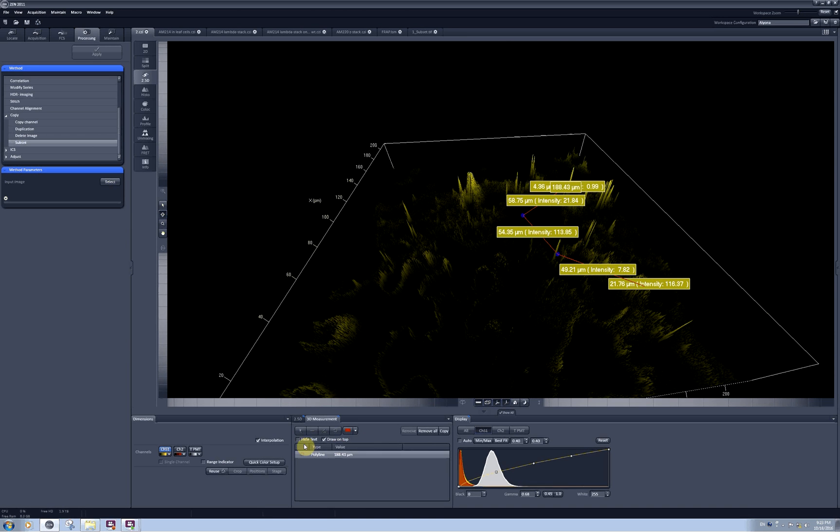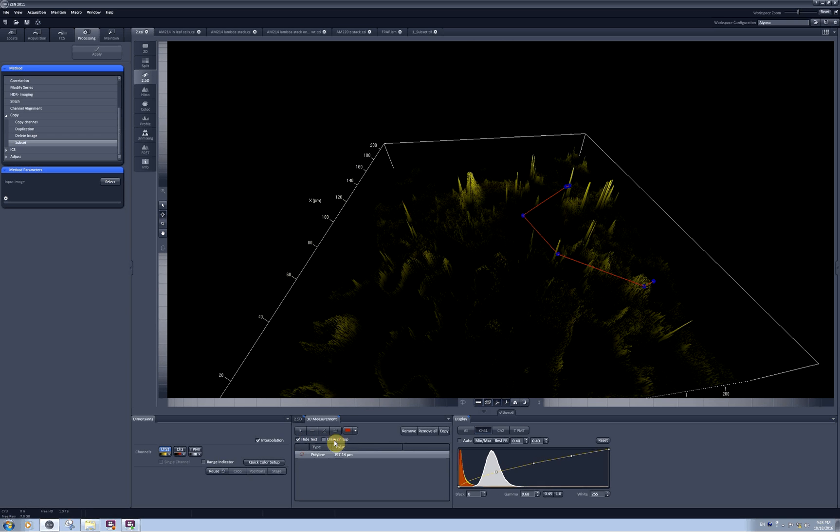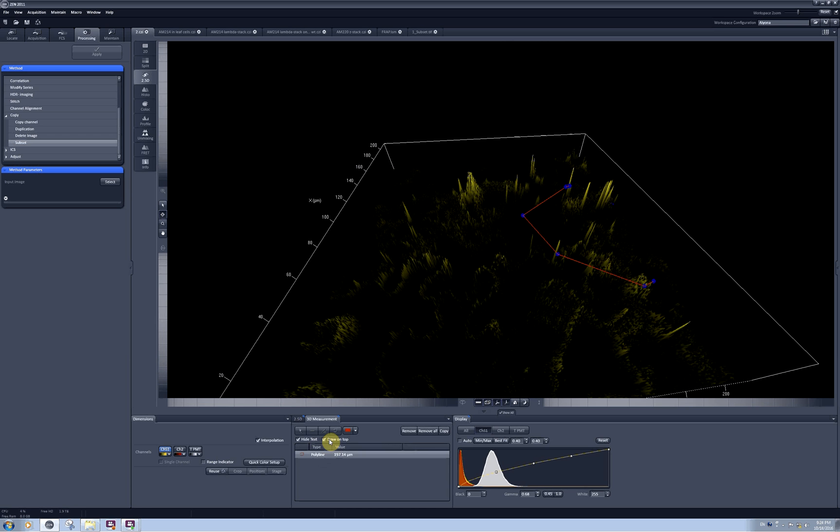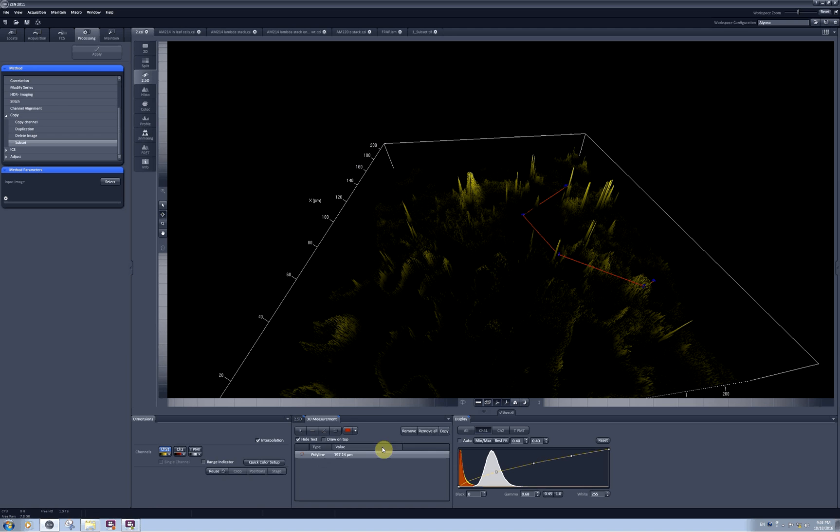And if you don't want to see this text overlaying your model you can check in the hide the text and also either draw the lines on the top or hide them inside your model. Currently you cannot see any values of the measurements but you can click on copy and this should copy all measurement values into the clipboard and then you can paste it into Excel sheets. Here we go.